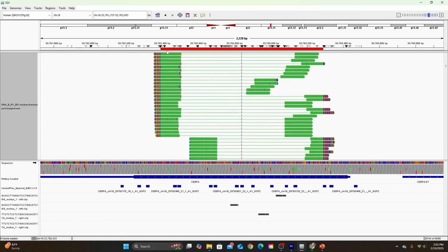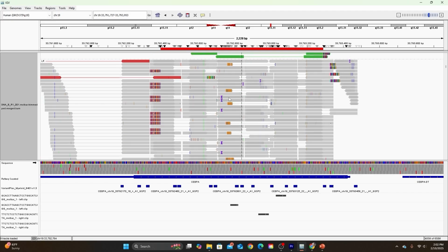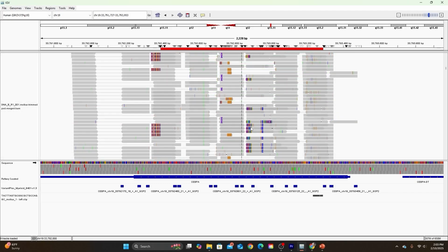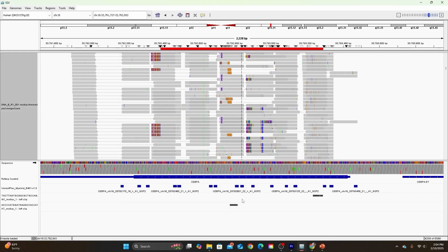And if we wanted to fill in the middle of these breakpoints a little bit more, we could scroll down. And these are soft clip bases that sort of line up with those that we were already blatting. And then here's some soft clip bases from inside the breakpoints. So this suggests an internal tandem duplication that's repeating. So we know that there's a region over here that's repeated over here, but these left clip bases are repeats from the reference genome over here.